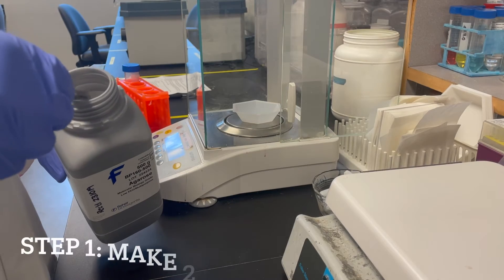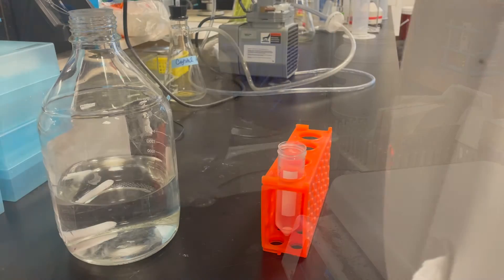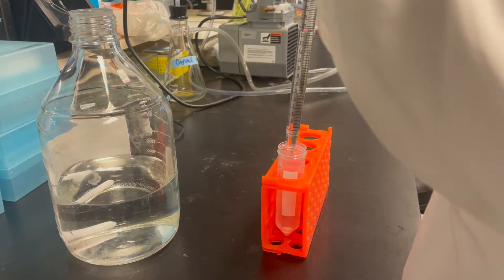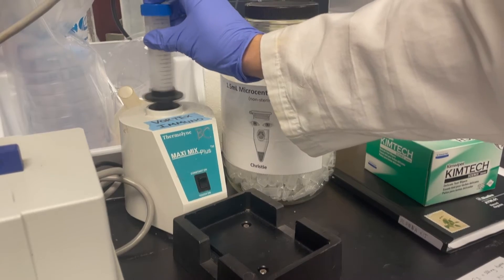Generally, the first step is making the agarose that the brain will be embedded in for sectioning. We use low melt agarose and dilute it to 2% in 1xPBS. Make sure to mix and heat in the microwave and homogenize.